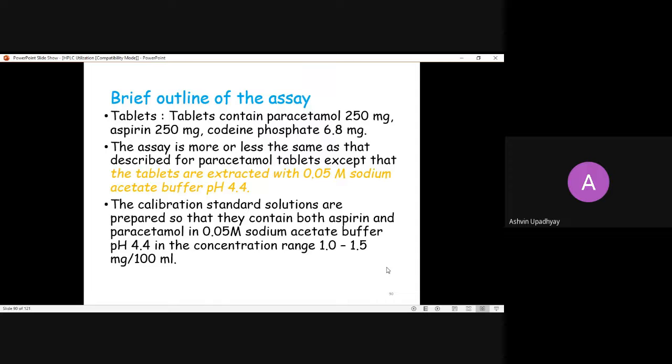So in this mobile phase we have to prepare different concentrations of standard solutions of aspirin and paracetamol. And you should not neglect the mobile phase. We can use this mobile phase as a diluent also, to avoid any kind of blank interference, because once we use another diluent, like a plain solvent or different water and acetonitrile concentration, then since your mobile phase is acidic pH having the buffer, it may give a noisy baseline or baseline drifting. So we have to select the same diluent for the preparation of standard.